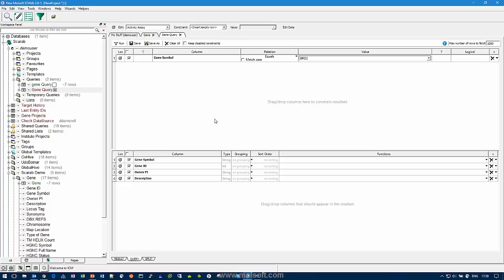Great. Yep. Thank you. That's great. We had another question. Can Scarab be used for SAR? Well, yes, absolutely. The scenario I imagine you're thinking of, if you allow me to interpret the question, is that you've got some compounds with structures, and you've got some assay data, and you would like to be able to build an SAR table from that.